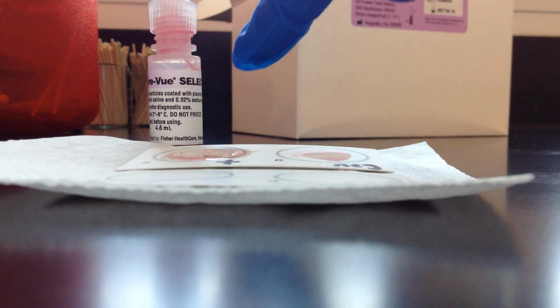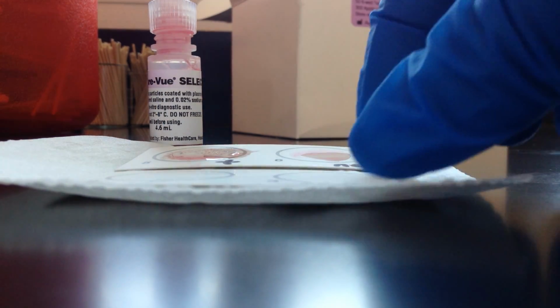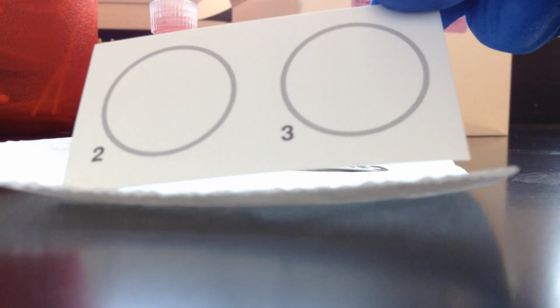So you can actually work with plasma itself, but we're actually going to use a kit that makes it a bit easier to read. So I've got my starting reagent here, my test strip here, and there's little circles on it. Hold that up so you can take a look at that. And on that you will place the reagent and the bacterium.